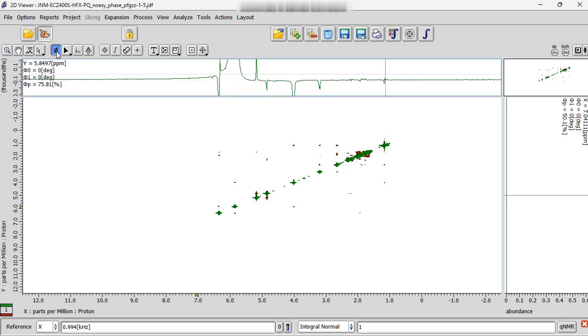Now again go to phase. Now for the PH1 adjustment, this line should not be changed. It will be the same place. Then hold Alt in the keyboard. Then cursor changes to the PH1. Then you can adjust the phasing. Phase adjustment: left click in the mouse, move horizontally. The phase will be adjusted.